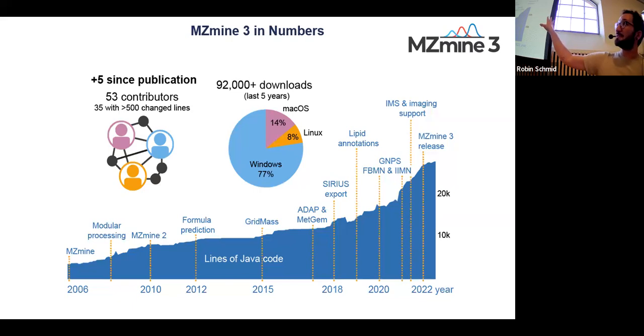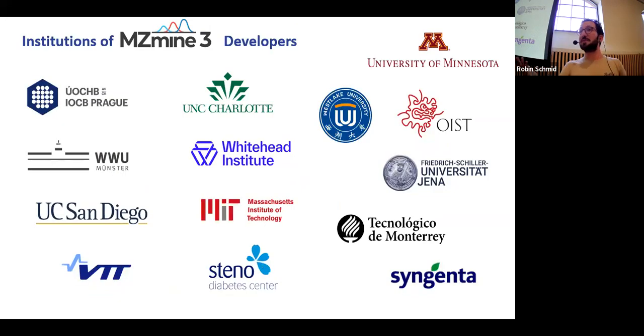And so MZmine has been in development for 20 years. Tomasz Pluska was really a driving factor when he modularized the whole project and then published MZmine 2. Since then, we have 53 active contributors over the whole time course, and many different features being added by many different institutions.